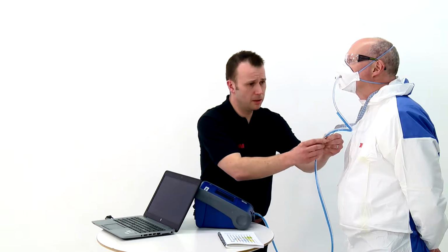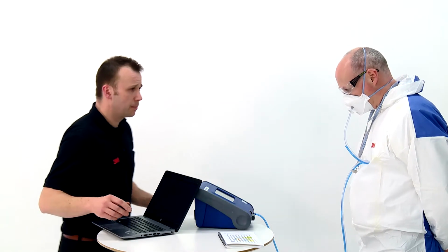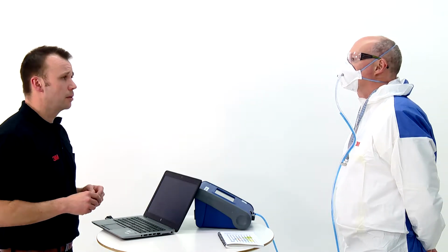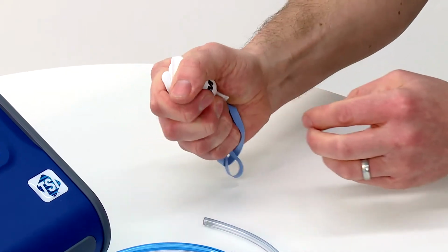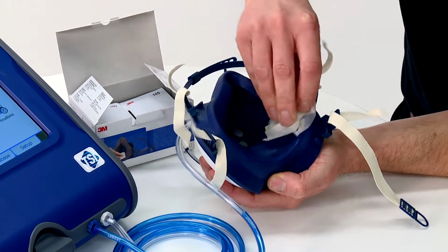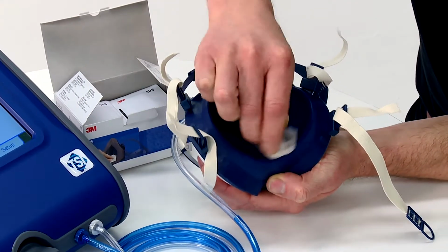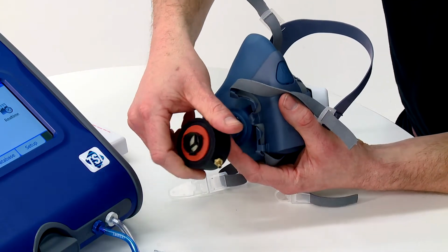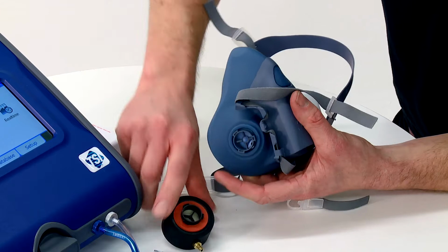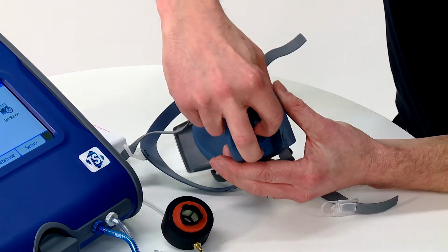Always check that there is sufficient slack in the tubing during the fit test, so that during the fit test exercises, the tubing does not pull on the respirator and affect the respirator fit. Upon completion of fit testing, you must dispose of probed disposable respirators. For 4000 series respirators, these may be hygienically cleaned and reused for further fit tests only. For reusable respirators, simply remove the 601 fit test adapter and internal tubing, taking care to ensure that the respirator is intact and not damaged.